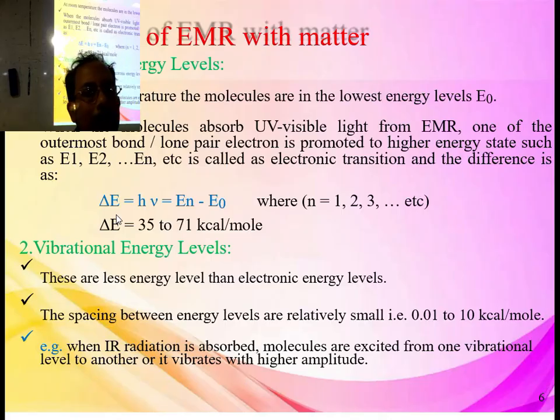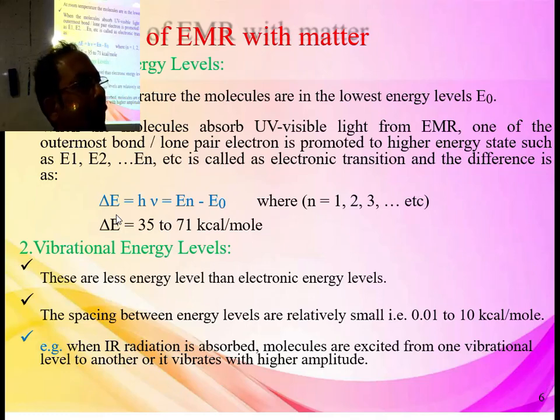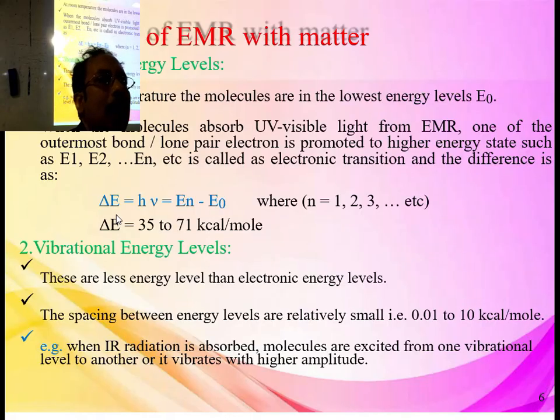The atomic spectrum is only a theoretical aspect, with less practical implication, but here you use spectroscopy for analysis of samples, for a different purpose altogether. Say you have some water and you doubt that it contains some drug.